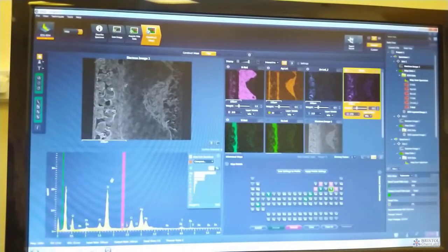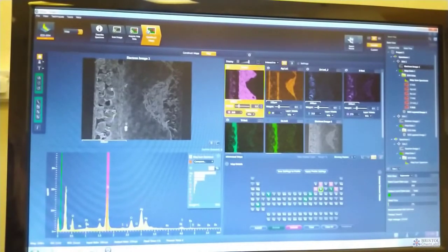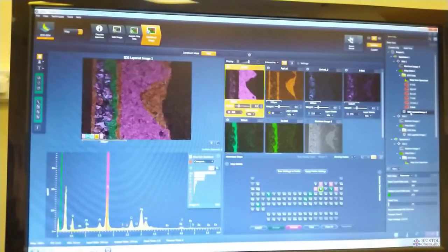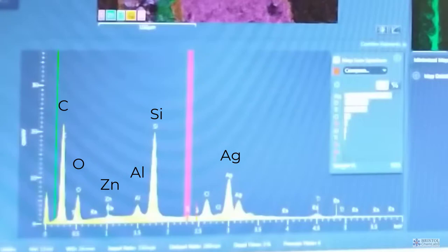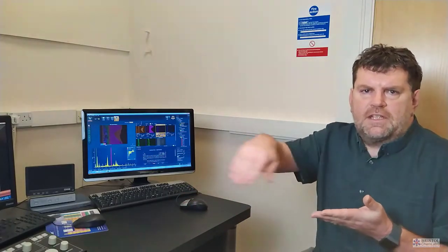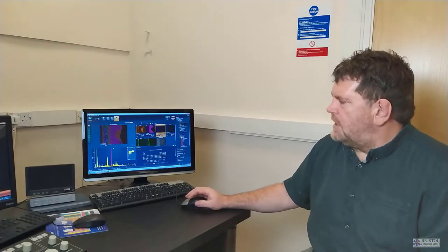But as well as telling us there's silicon in there, because we're scanning the sample, we can actually match the energy of the x-rays with where they've been produced in two dimensions within the sample. So in this magenta map here, we see the element distribution and these features are very silicon-rich within the material. We can overlay all the maps showing all the different elements and how they're distributed throughout the multi-layered structure. The relative peak heights give an idea of the composition, so we can get percentage weight of individual elements. Because we're using a scanning electron microscope and the beam is being rastered across the sample, at each point we collect these characteristic x-rays with characteristic energy. This means we can plot out the actual element distribution within the sample.